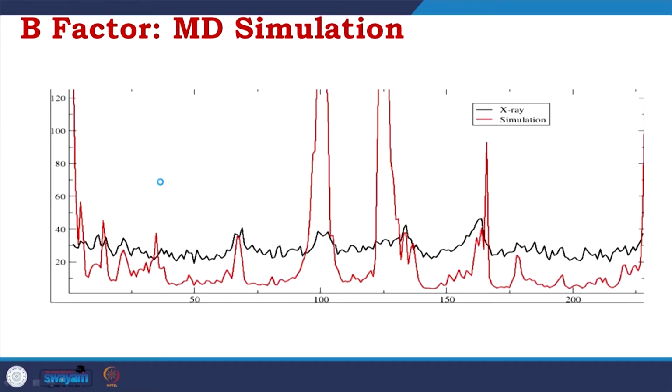For non-bonded it is Coulombic interaction, van der Waals interaction and hydrogen bonds. When you do that, you find which residues, like here nearly 100, are very flexible, most probably loops. You could learn the loop dynamics by applying MD simulation, and by comparing the B factor from the MD simulation and the crystal structure, you could easily get the differences.